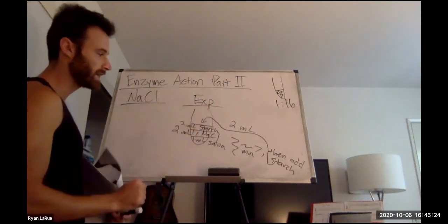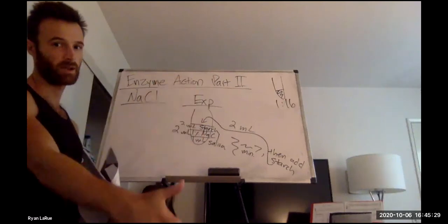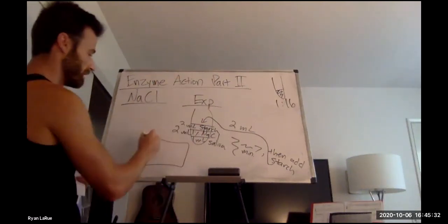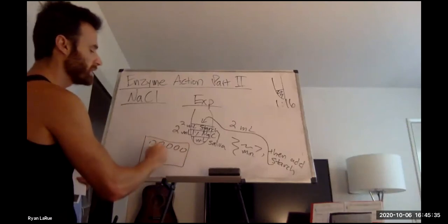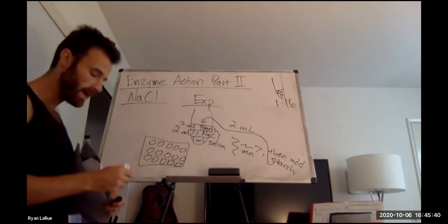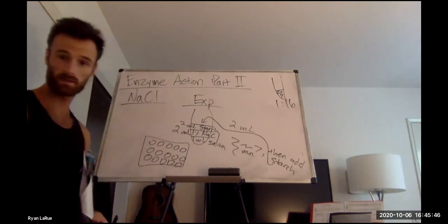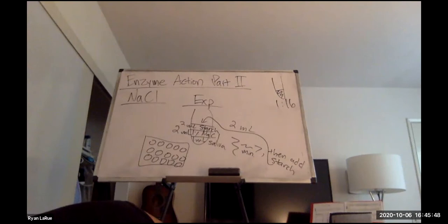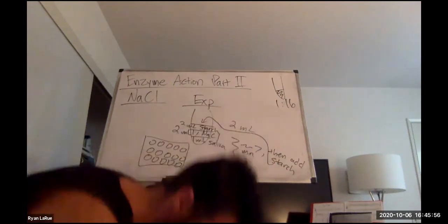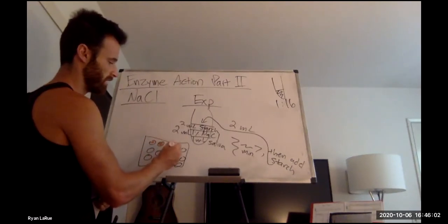So you wait 30 seconds, and then you would pipette 100 microliters. And remember, we would have our 96 well plate already set up. This is just a rough representation. It would be already set up with 100 microliters of that Lugol's inside each of the wells. Oh, should have had my orange marker ready. It's like a pale yellow.